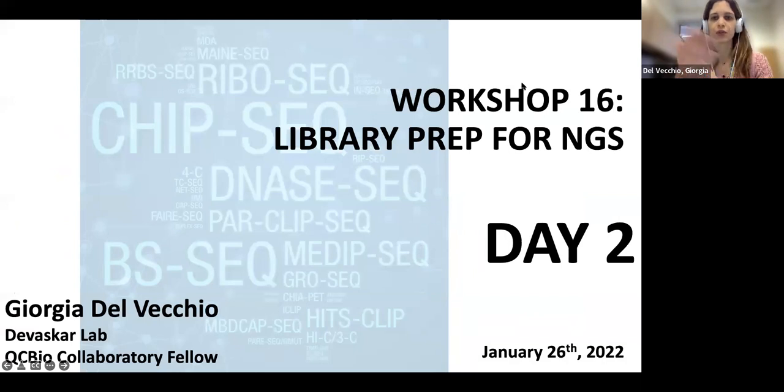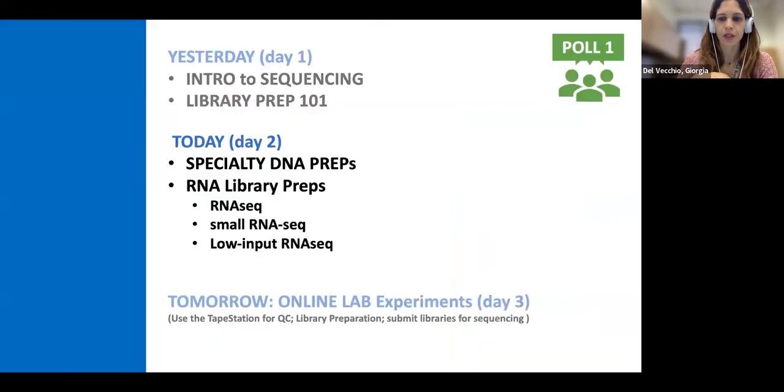Okay, welcome to day 2 of the library prep for NGS workshop. So today we are going to finish talking about specialty DNA preps. So we are going to cover the DNA methylation library prep, ChIP-seq, ATAC-seq, and then we will move to the RNA library preps world.